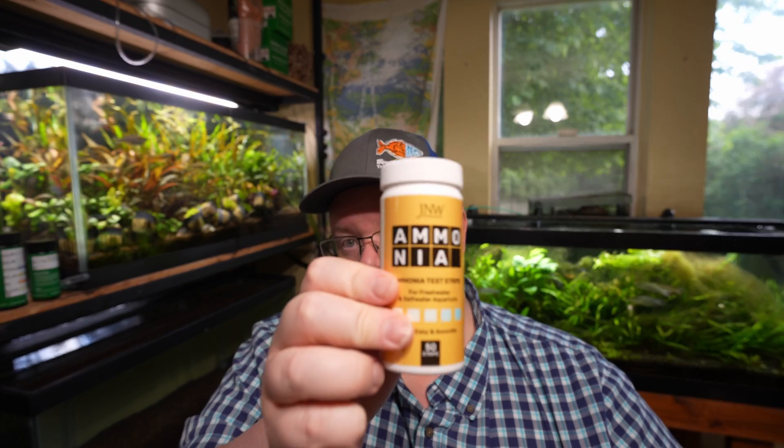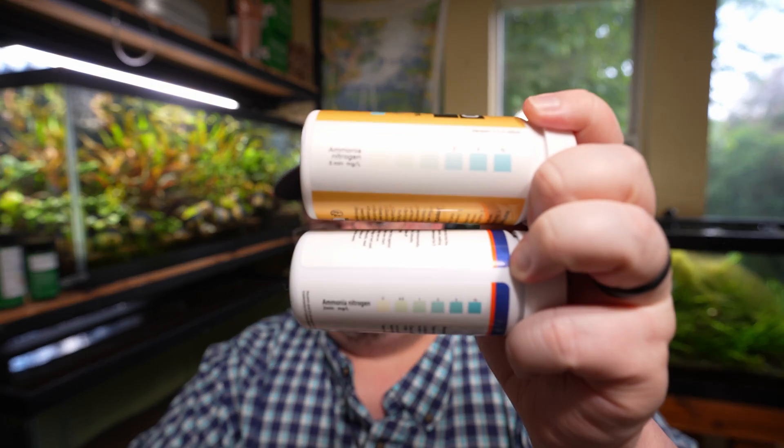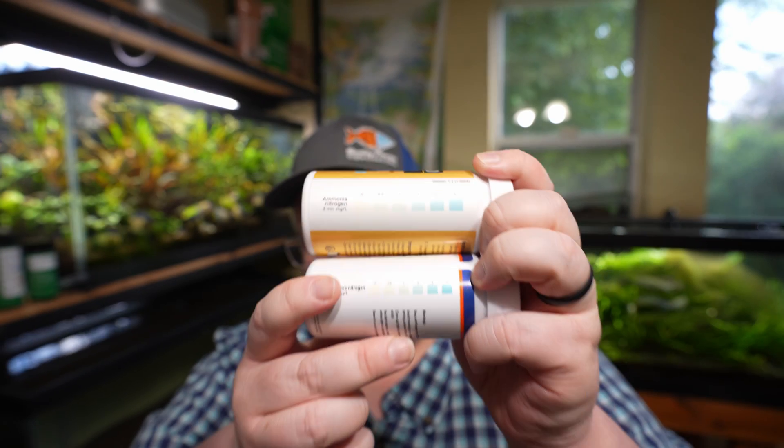So here's the deal. I have a couple of things I bought off Amazon: the Aquarium Co-op strips, the JNW — I think the cheapest strips on Amazon — the Aquion, and finally Tetra. You'll notice very similar charts when you look at the back of these — same strip, or at least most likely from the exact same manufacturer. And when I got my ammonium levels very high to where a liquid test kit would read them as 6+, these failed to read.